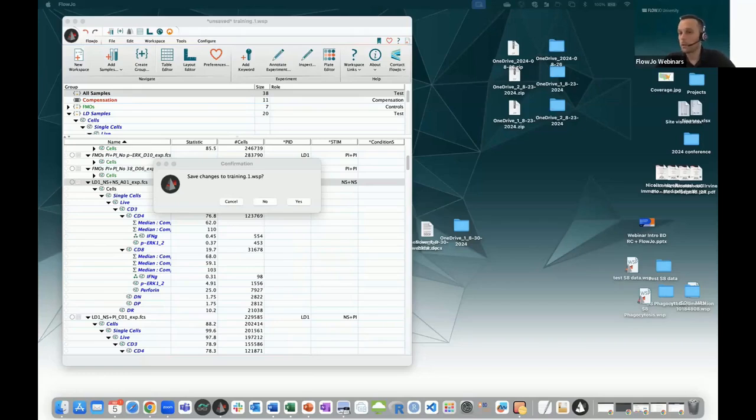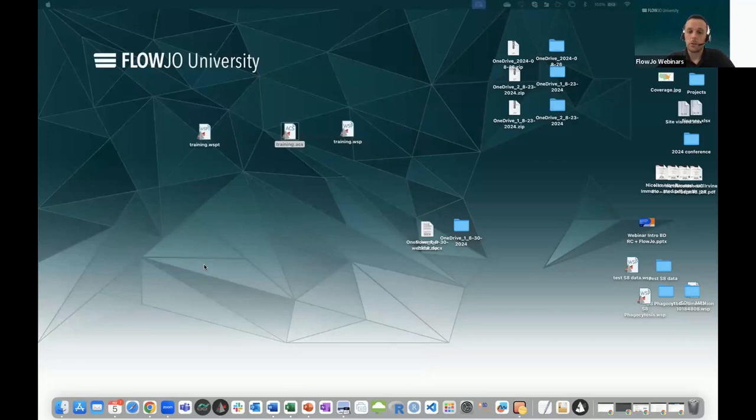It really depends on the amount of data that you have. Look at your FCS files, just your regular experiment. Whether you use a Mac or PC doesn't matter.